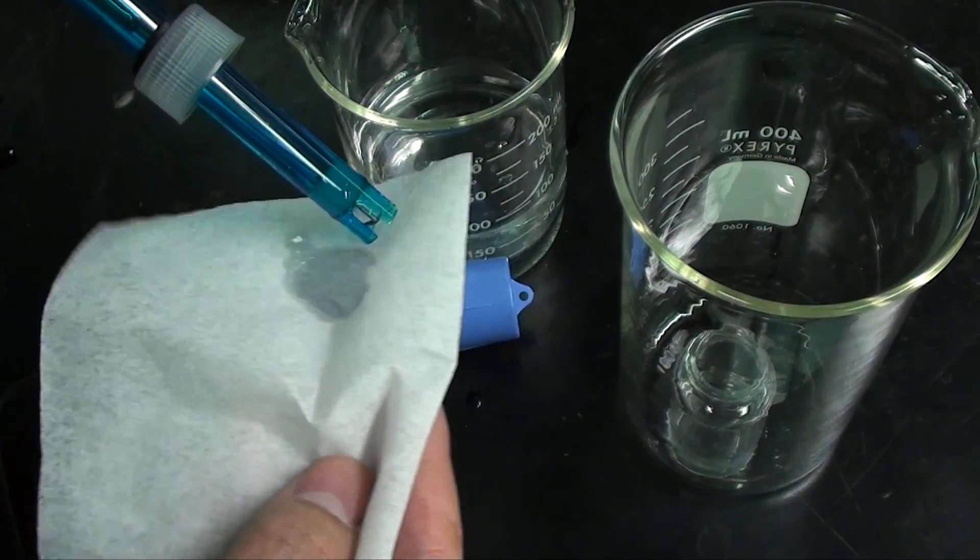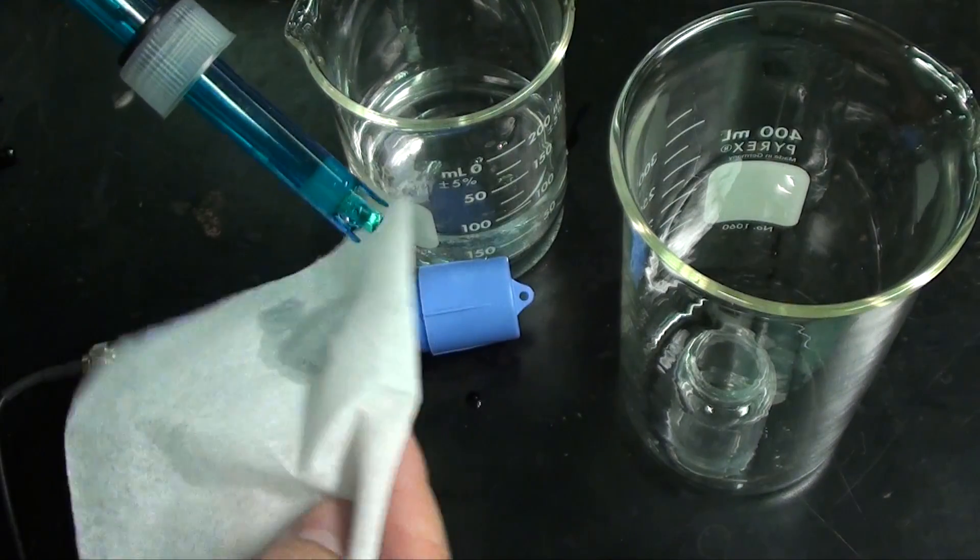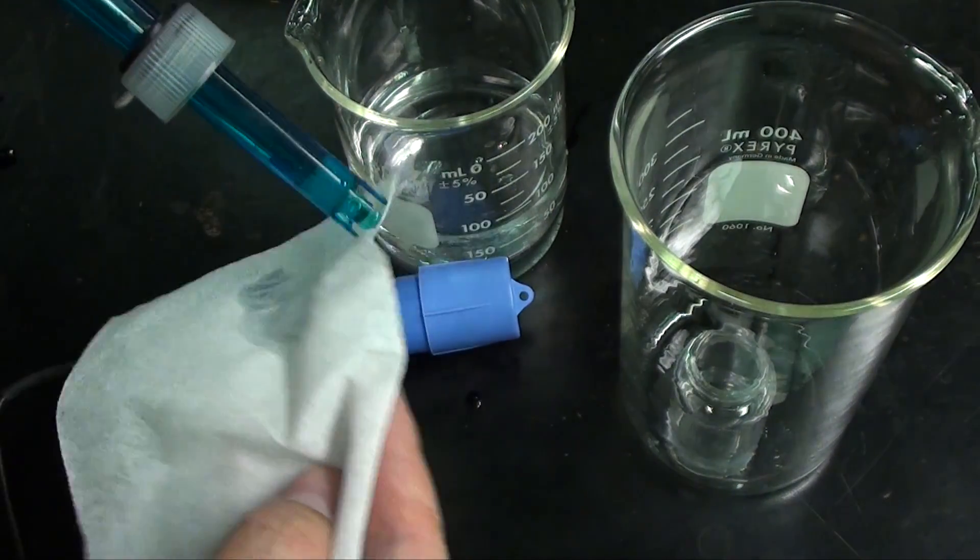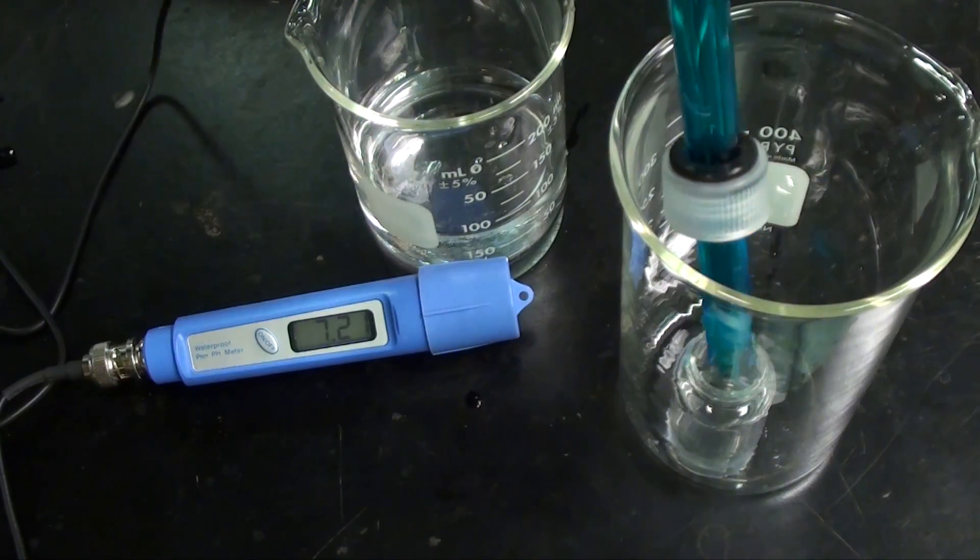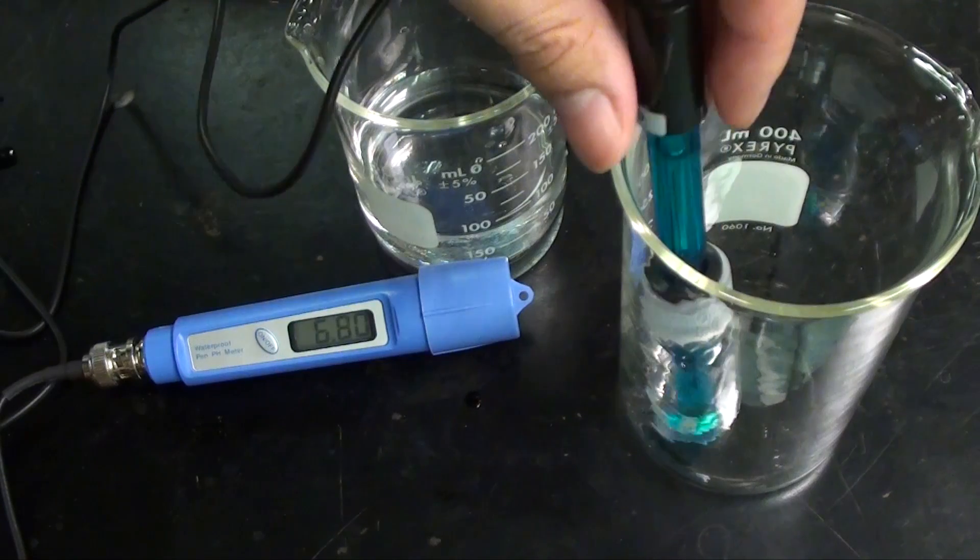Now I'm dabbing off the excess water. Be careful not to touch the glass bulb itself, you don't want to contaminate or scratch the bulb. Now simply insert the electrode into the calibration solution and give it a few minutes to equilibrate.